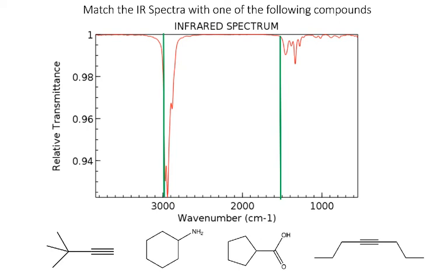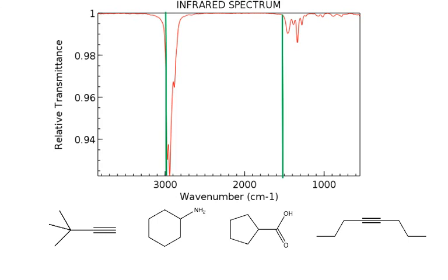All right, in this spectra, there's not a whole heck of a lot going on. I've got some CH stretches in this region. There's nothing else really in the diagnostic region. And so when I look at the molecules that this could potentially be, we've already kind of eliminated this guy. Carboxylic acids are very distinct. For a carboxylic acid, I should have a broad, sort of hairy beard type thing in this region, which I do not have. So it's probably not the carboxylic acid.